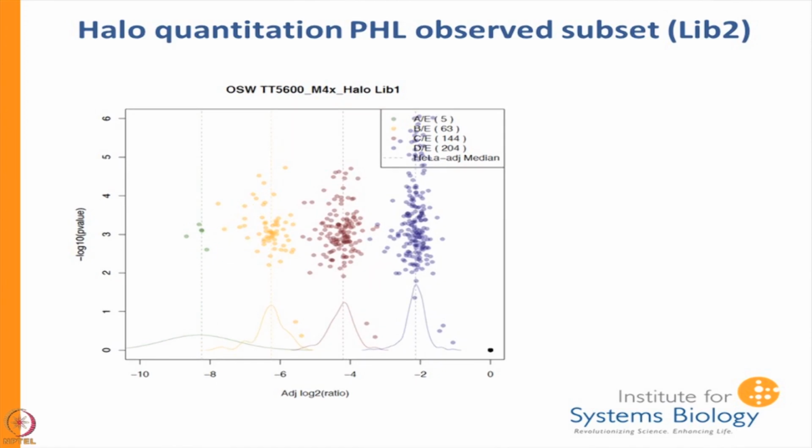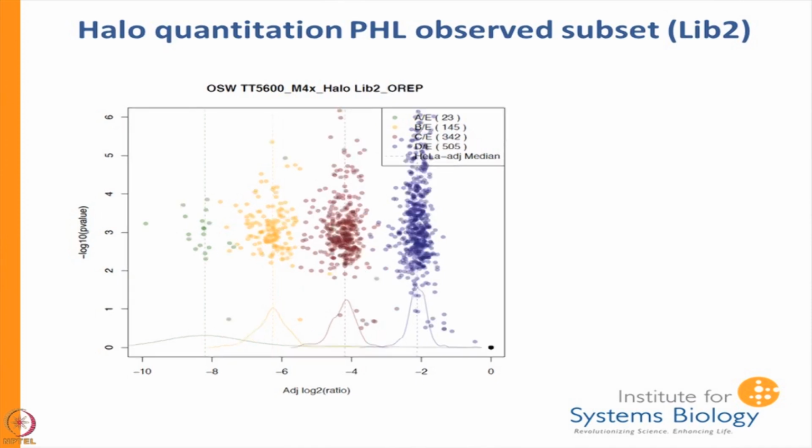And so basically, these lines along the bottom are a density plot. So kernel density basically gives you an idea of how these things are spread out. Because if you look at this cloud of things, it's kind of hard to tell. But you can see that these things are a little bit misshapen. And that's an indication that there's something a little bit weird about your data. This one has a pretty pronounced shoulder. And so sometimes what we do is we actually cut this one off at a CV, a coefficient of variation of, say, 20%. So we exclude data that is problematic.